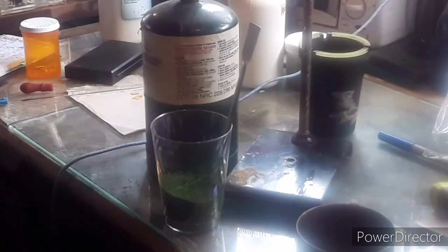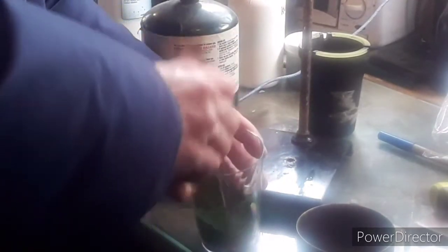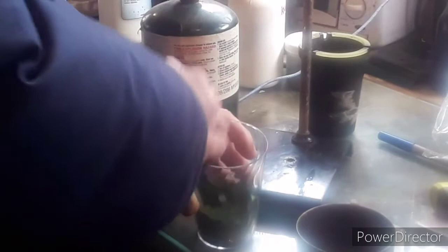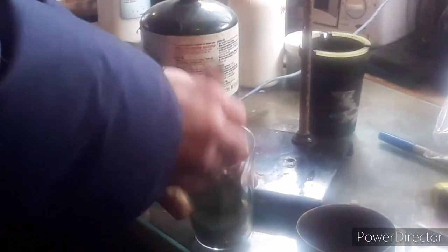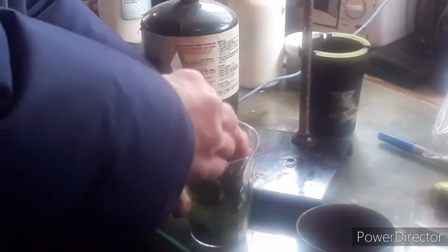Hey guys, I'm back. Sorry about the rather long hiatus. What I'm doing today is I'm going to make potassium chromate and dichromate from chrome oxide. This cup has 25 grams of chromium oxide — Cr2O3 — the cheapest form of chromium I can find. There's also 25 grams of potassium nitrate and 25 more grams of potassium hydroxide. I'm stirring it to get as intimate and homogenous a mixture as I possibly can.